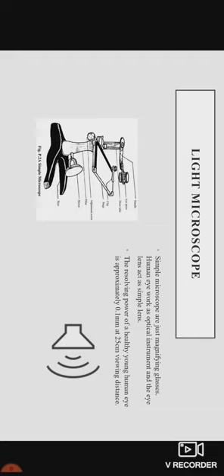It uses glass lenses to magnify and visible light to illuminate and passes through a specimen.